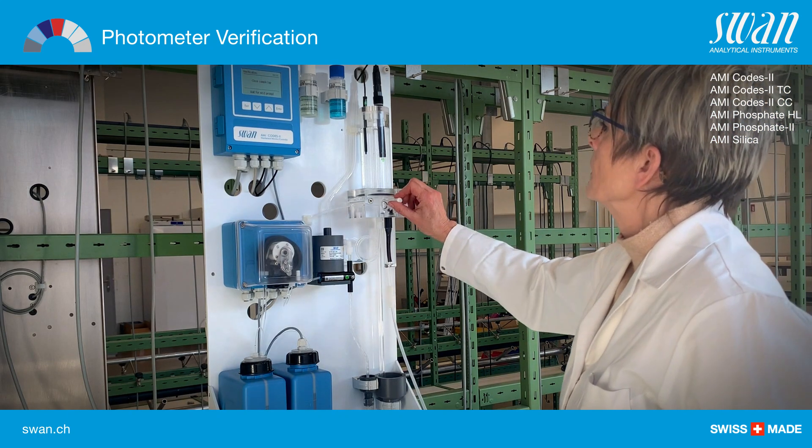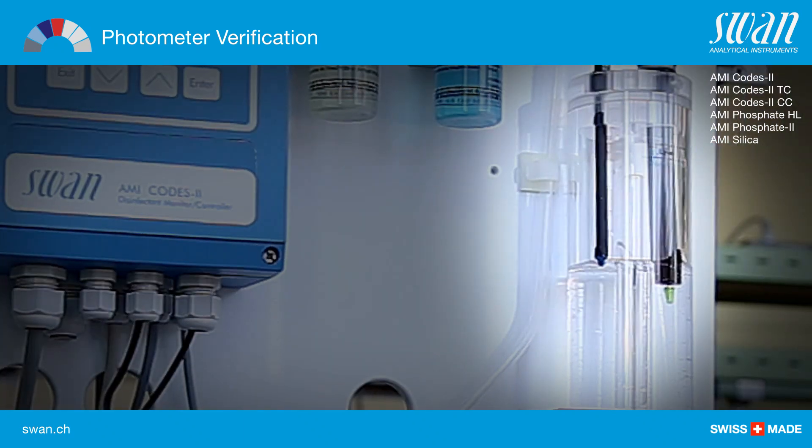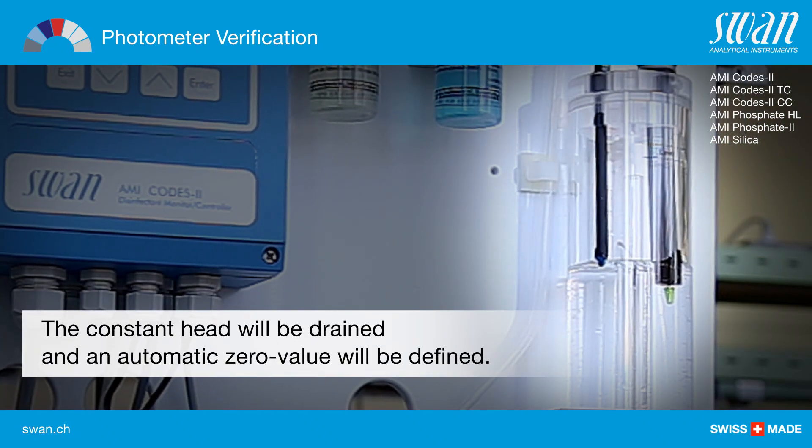Stop the sample flow by closing the regulating valve and wait for the next prompt.